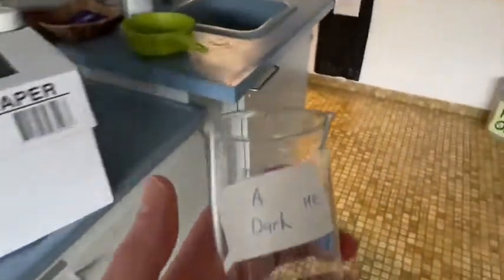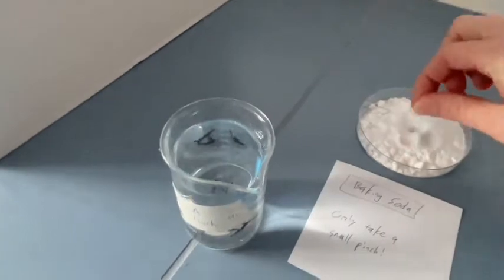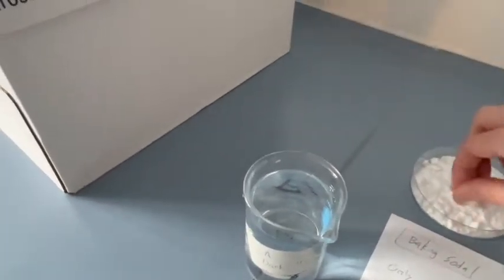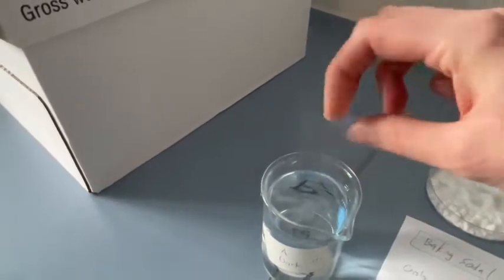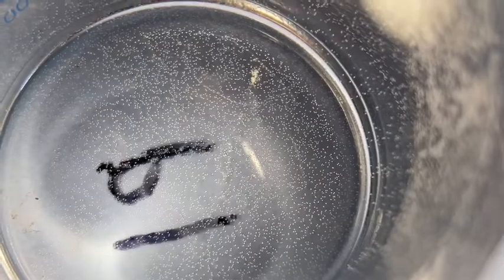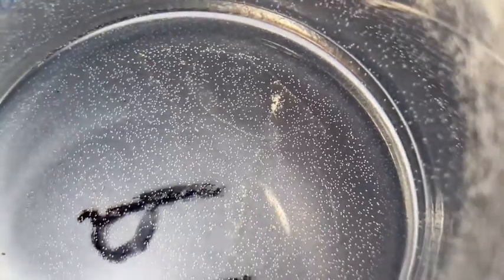So students can do that with both of their beakers. Remember to emphasize experimental design with them. So this is a constant, okay? Each experiment has the same amount of water, and it also has baking soda. As you can see, the bicarbonate, the baking soda, creates nice little bubbles of carbon dioxide that get dissolved into the water.